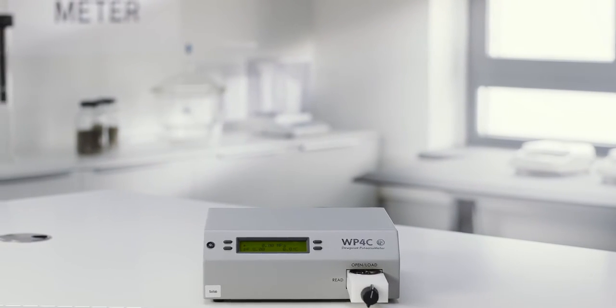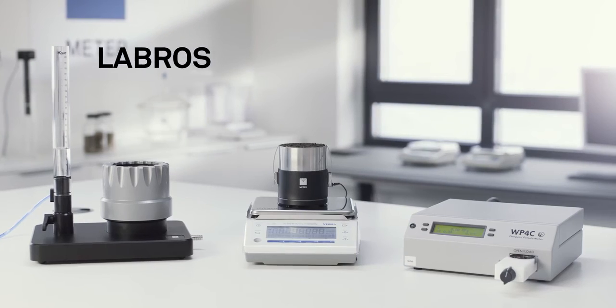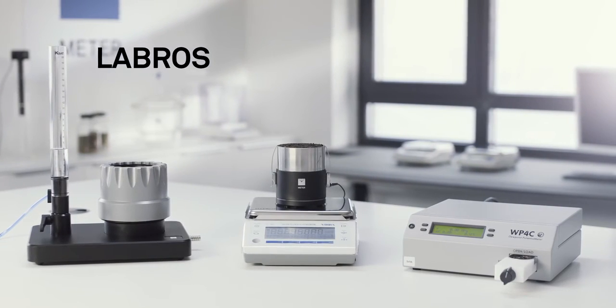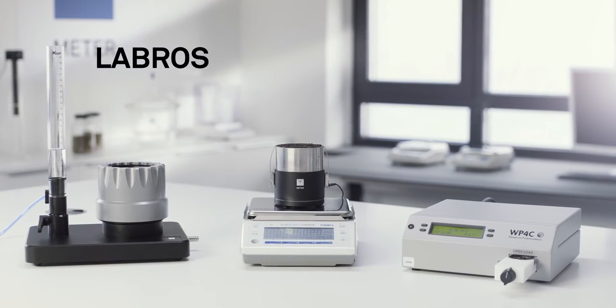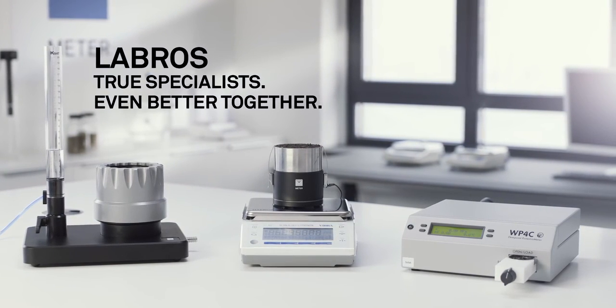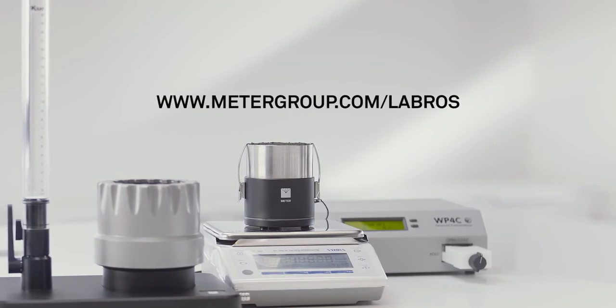Labros, the innovative soil science laboratory collection by Meter. True specialists, even better together. Contact us now for a custom quote.